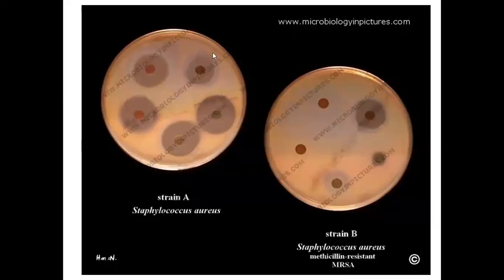Here you can see usual Staphylococcus aureus, and you can see good susceptibility to antibiotics. You can see big round zones of antibiotic sensitivity, so bacteria can't grow nearby the antibiotic disc. But here you can see strains of methicillin resistant Staphylococcus aureus, MRSA. And you can see that they are susceptible only to one antibiotic, and other antibiotics do not act on this strain.